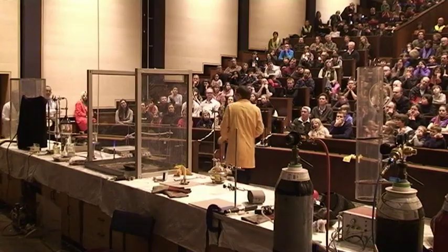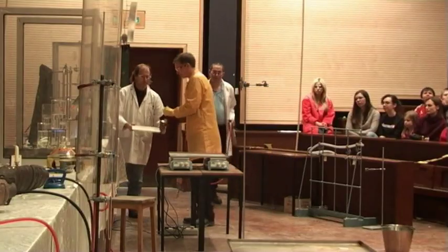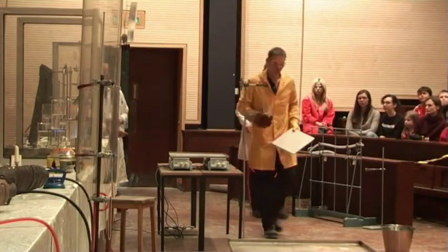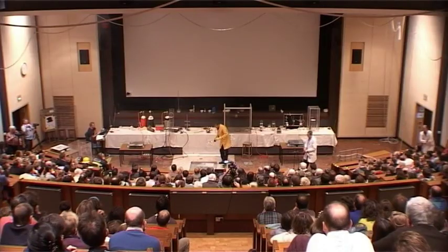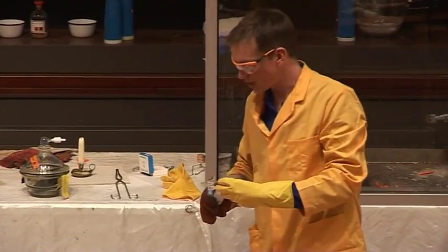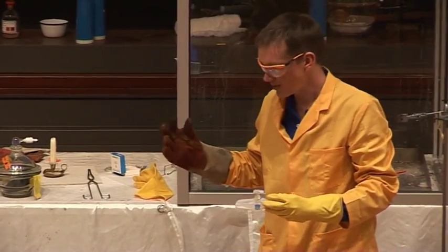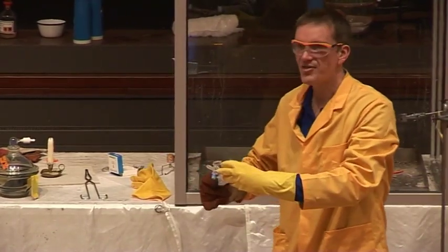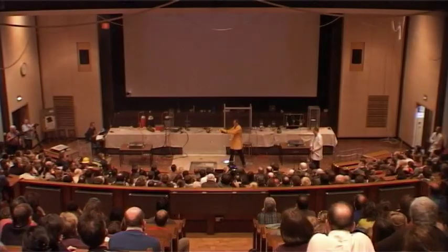Okay, well, we have here another substance that's very, very reactive. And this compound contains a metal. It contains lithium metal, and this should give it a flame, a red colour. And it also contains something, well, as soon as it comes into contact with any moisture, it forms methane, and methane is very flammable as well. So this should start all by itself as soon as I take the top off of this. Again, it's stored under argon.